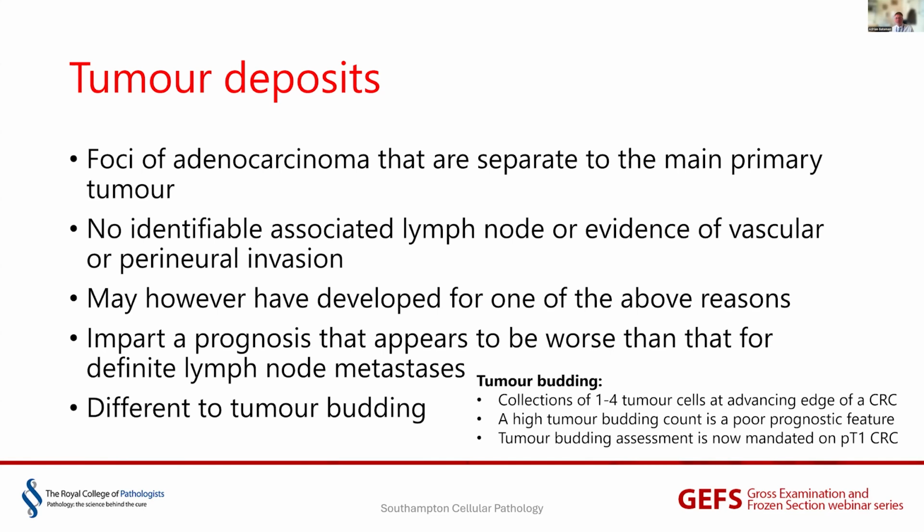I've listed what tumour budding is there. That's a very microscopic assessment that is now mandated in the UK for pT1 colorectal cancers, for example, and this is quite closely linked to worse clinical outcomes. So they are different to tumour deposits.